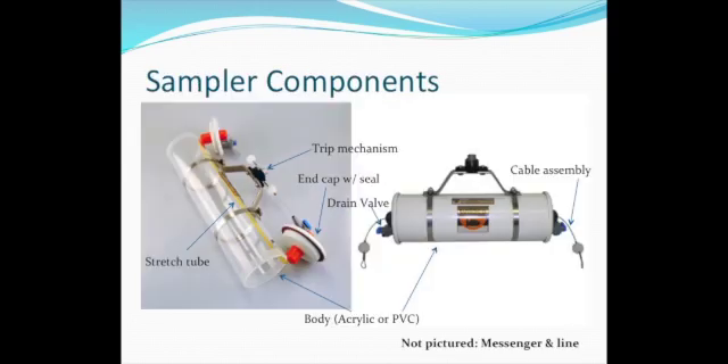Here is a breakdown of the parts of a Van Dorn bottle. The core of the bottle is a tube with two end caps that are connected with stretch tubing. Each end cap has a cable assembly which connects to the trip mechanism, similar to arming a mousetrap. When the trip mechanism is pressed, the end caps are released to seal the bottle. Drain valves are included in the end caps to pour the sample through tubing as needed.